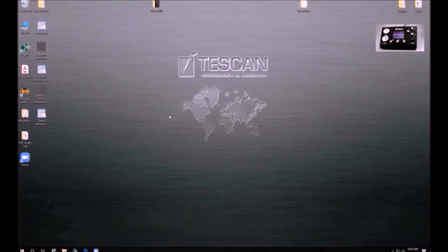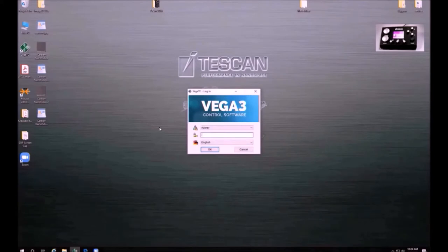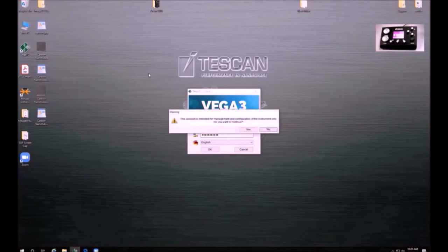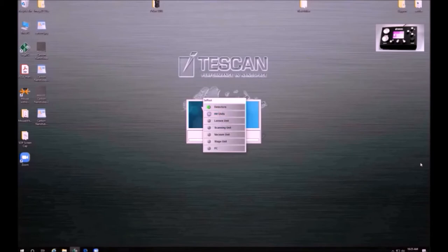Now that the system has come down to vacuum, you will be ready to go through the software portion of this tutorial. In order to load our sample, we will first have to boot up the software by going to the Vega TC icon. From here it will ask you for your password. You can work with Tom Alston in order to set up an account for the software. It may take a few minutes for the self-test to be complete, and then you'll see the software open.